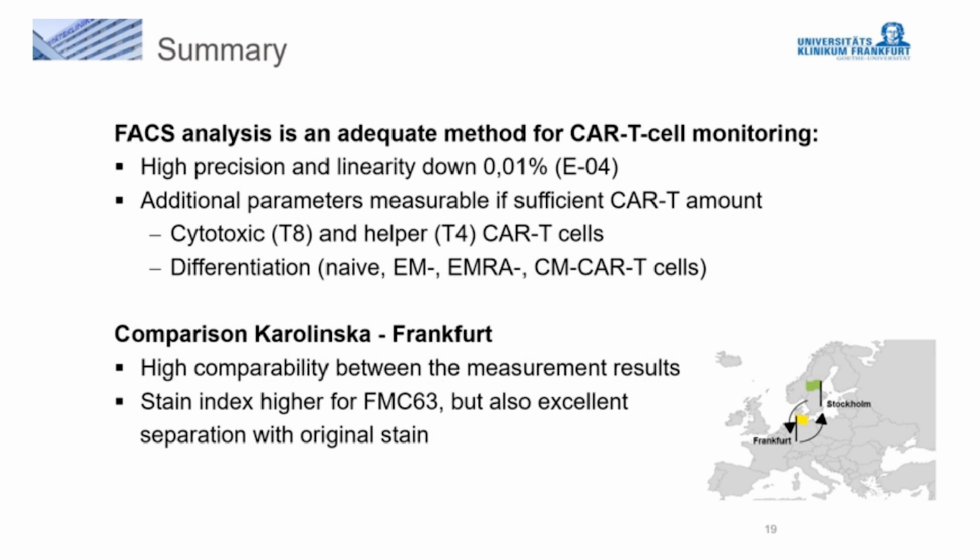Furthermore, I showed you the results of our interlaboratory comparison with the Karolinska Institute, showing a very high comparability between the measurement results and a higher stain index for FMC63, but also excellent separation with the original stain.